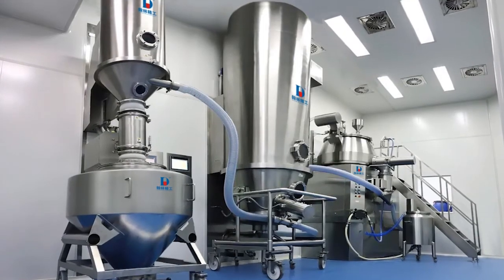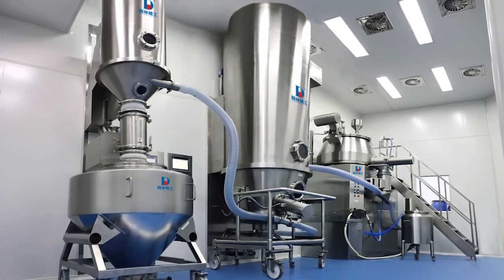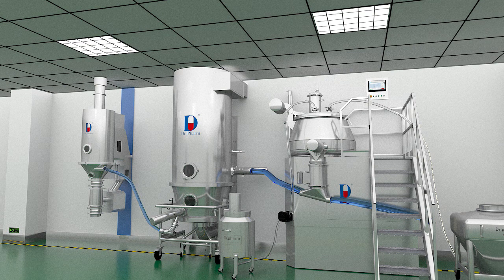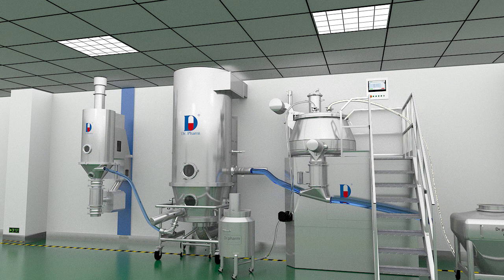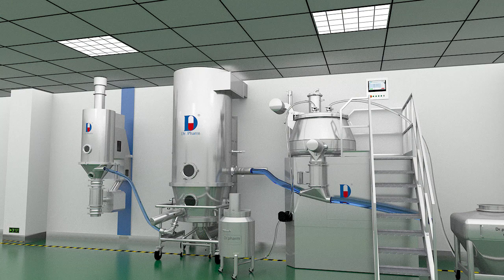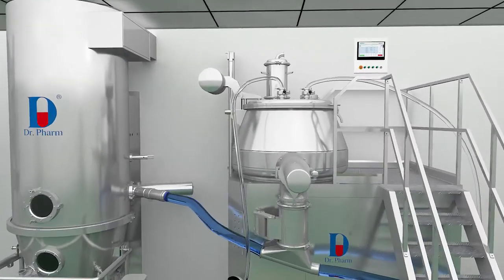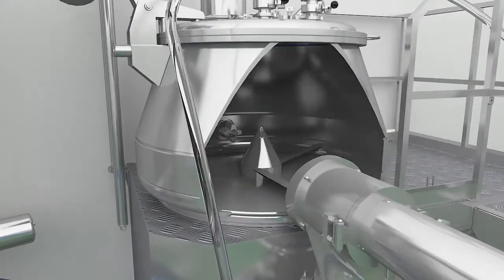High shear mixer with vacuum loading or gravity loading. The pot body is designed with a cylinder and a cone. The diameter of the pot body is large, the cylinder section is short, the cone section is high, and the mixing efficiency is high.